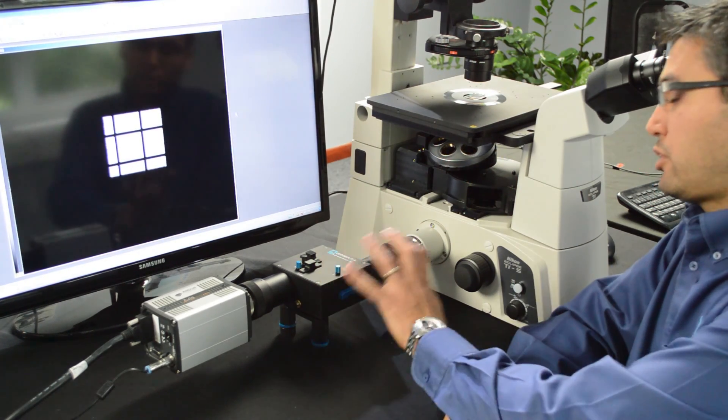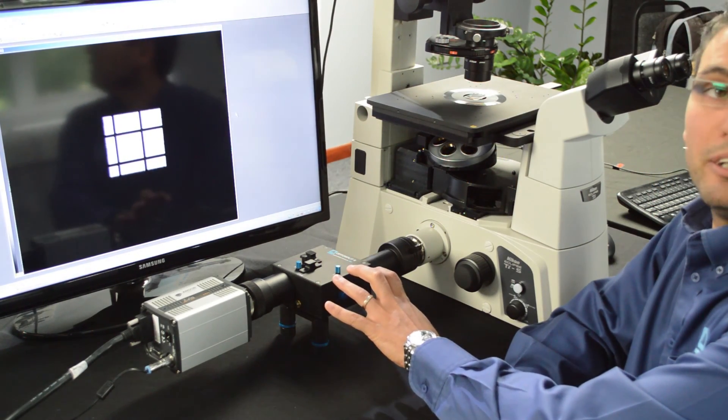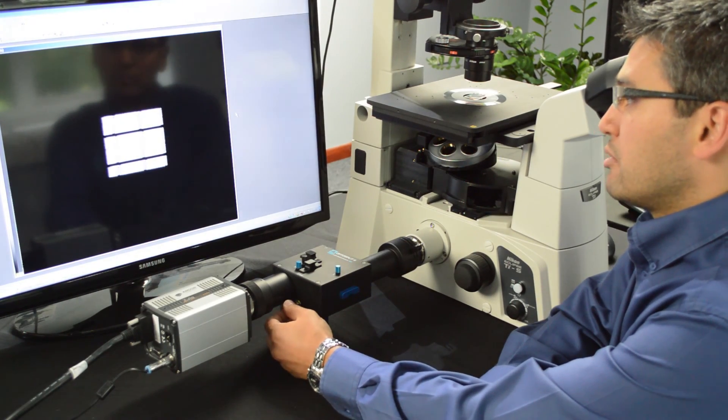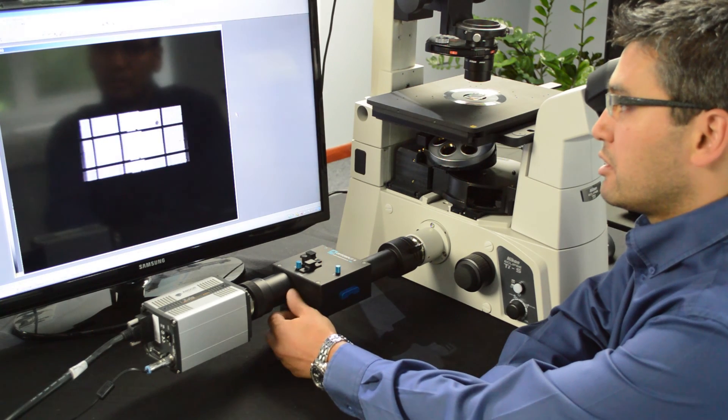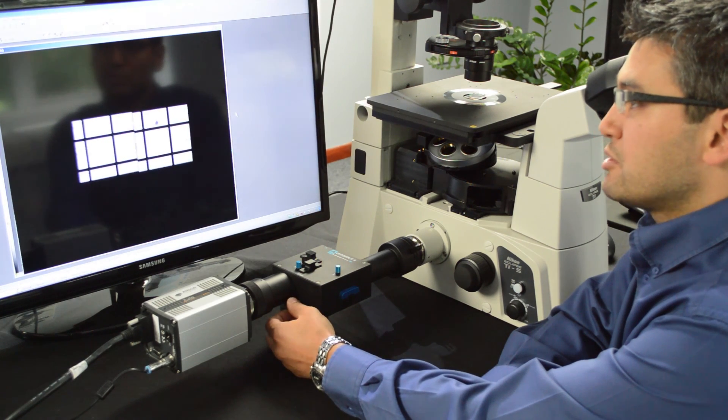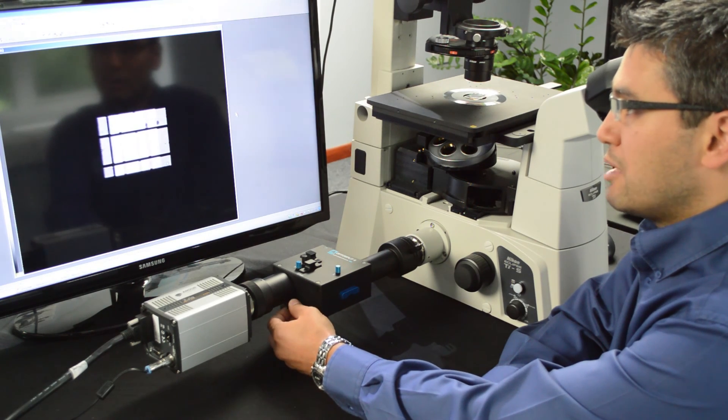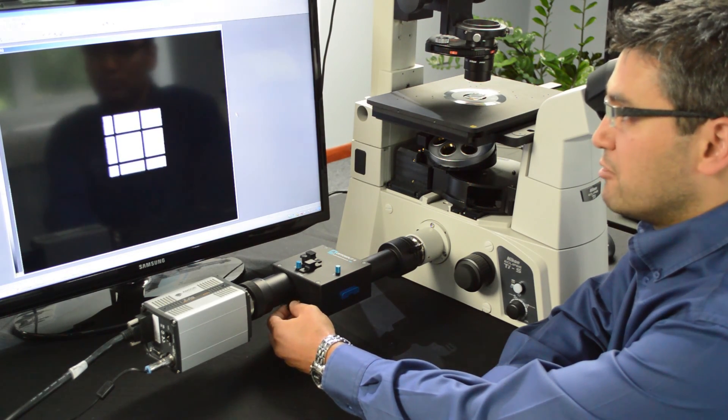You have your calibration cube in the OptiSplit and the next thing you want to do is to bring your images or your emissions together and make sure that there's no aberration and make sure that they overlap.